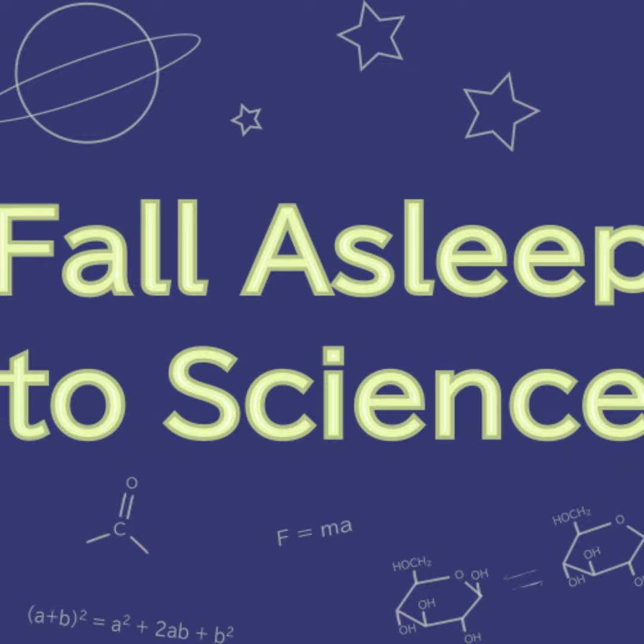Immediately between the orbits is a pair of frontal bones. Behind them are the parietals. Under the frontals and parietals is the cerebrum, consisting of two cerebral hemispheres, the thinking part of the brain, the part, that is, with which you cerebrate.